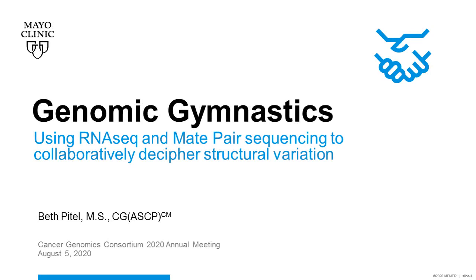I'm really excited to share a retrospective study with you today involving the utility of RNA-seq and mate-pair sequencing to collaboratively decipher structural variation. These methodologies are often seen as competing, but we've found that they often complement each other very well.